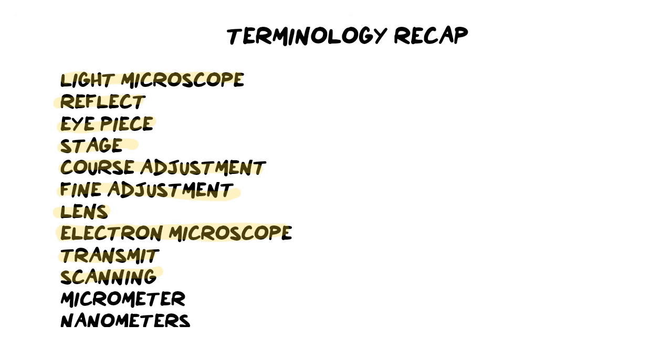And last but not least, I mentioned the two ways we measure things in microscopes, and that is with micrometers and nanometers. And they are the two units of measurement that we must use. Keep in mind that they do have an unusual symbol, particularly micrometers, because mm is already used, isn't it? It's used for millimeters. So what we have to do is use something like an upside down H and a U at the same time, and that is what we use to annotate a unit of micrometers.